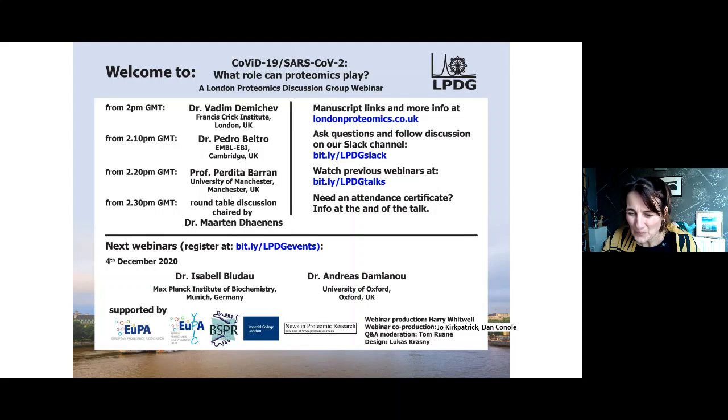But we'll see. Maybe a last one on that is, and I don't want to put you in this place actually, but there we have again the alternative being MALDI, also being suggested, which has been proven to be very efficient for biotyper-like applications for finding prokaryotes at least. It would be, I think, the first time they're trying to use it to detect viruses. Yeah. So two, as I said, two of the labs, Pete O'Connor in Warwick and Raina Kramer in Reading, are absolutely evaluating MALDI. They're doing that.